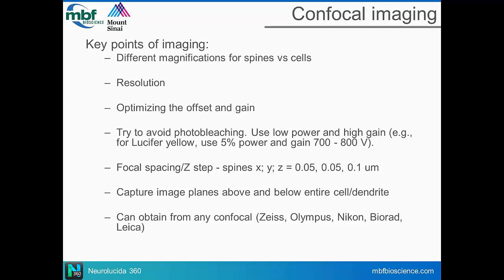And there are some systems now which make it really easy to take multiple images and tile them together. We've done that many times before, and we'll use about a 10 to 20% overlap when tiling. We took it at 40x or 63x resolution. In the neuron we showed that we filtered by site after recording, that was under 40x magnification. Our x and y were 0.1 and our z was 0.2.